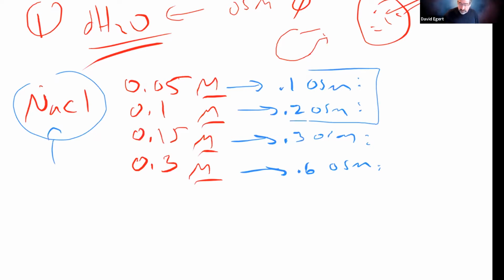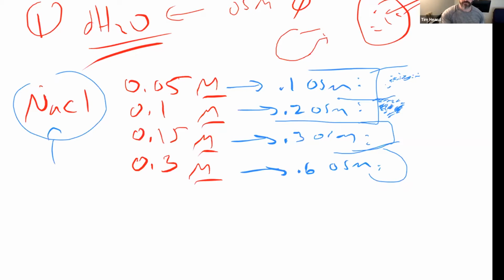What's going to happen in these different cases? What's going to happen in the case of the 0.1 osmolar? Hemolysis. Yeah, I'm going to expect hemolysis. I'm hypoosmotic. It's going to be hypotonic. Water will come in. What about here? 0.2 osmolar. Same thing.